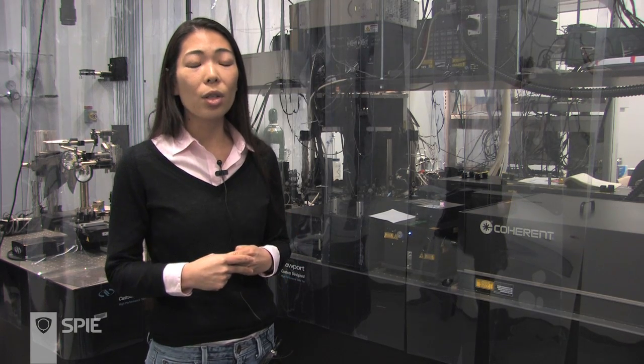You really only reach the intensities where you get significant multi-photon interaction at the focus of one of these femtosecond lasers. Without this high-intensity technology, we wouldn't be able to do this within the depth of living tissue.